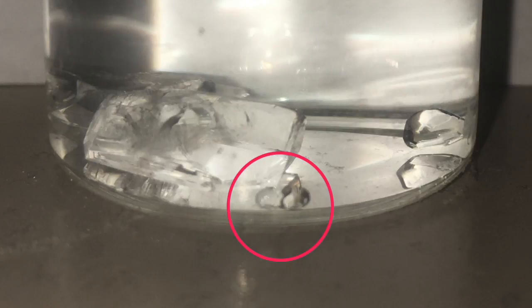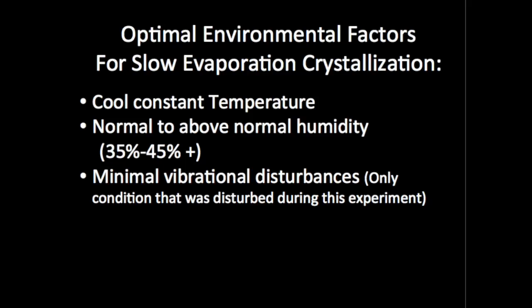Some of the small crystals are impossible to capture clearly on camera, but in this next picture, I did manage to capture the two largest small crystals. All of the crystals are clear octahedrons with flat smooth faces and sharp edges and corners. I believe that the reason several small crystals are forming is because the vial accidentally tipped over since the last video. This disturbed the stationary positions of the alum crystals.